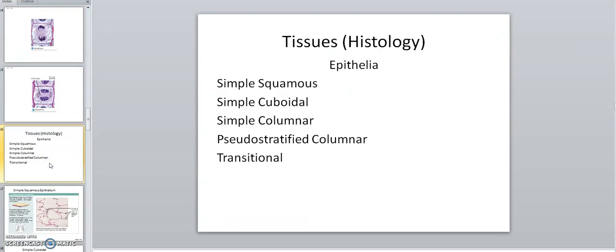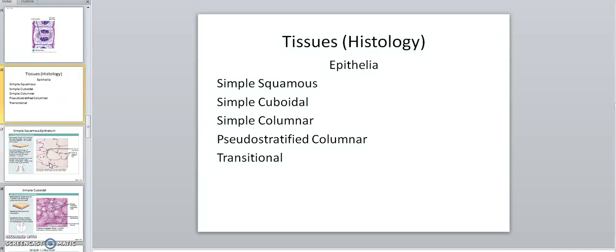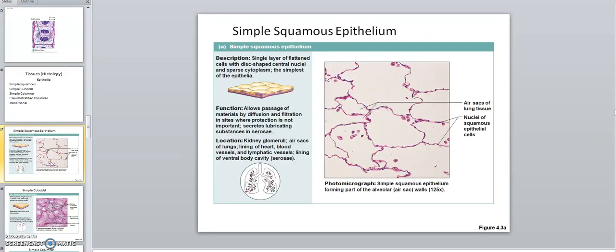All right. Now I go to my histology. And we're going to start first with epithelia. Remember, epithelia lines and covers. All right, right here is simple squamous. See how thin it is? There's the description right there. So if you saw this, that's simple squamous. This actually comes from the lung. That's why I'm saying no slide has all the same tissue.